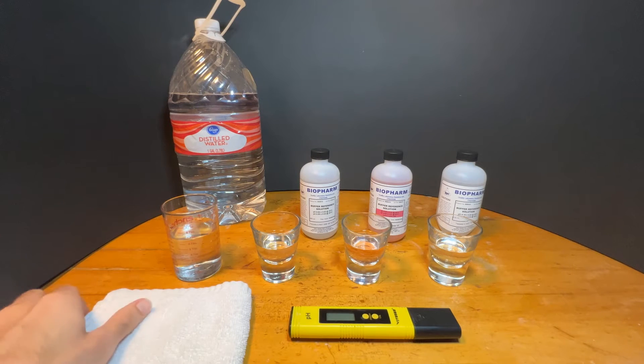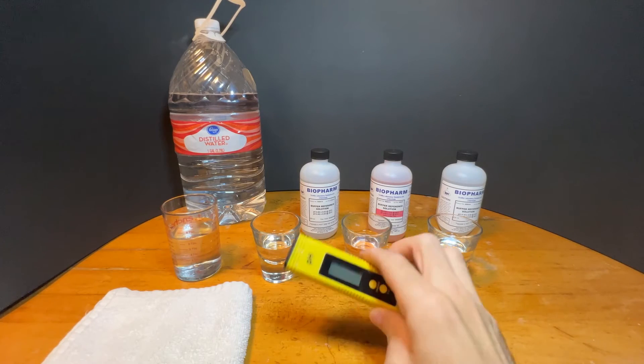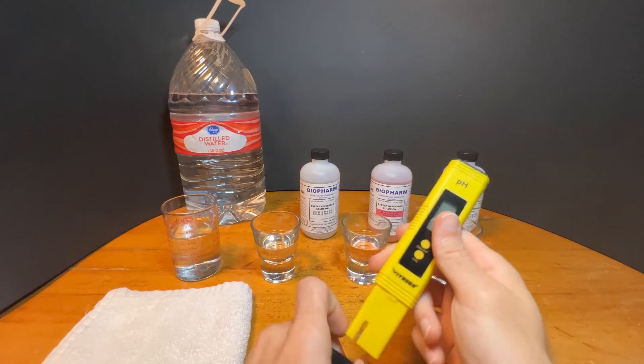Be sure to have a clean dry cloth nearby. Let's start by rinsing off the PH meter in distilled water, then shaking it and drying it off.